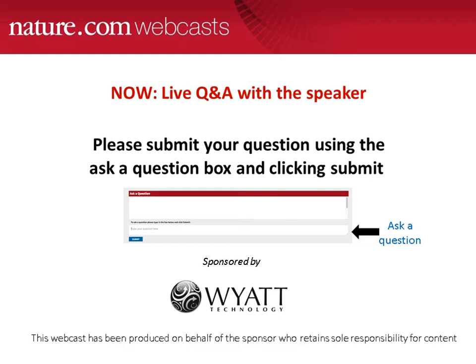Excellent, thanks, Eva. And our next question asks, what, in your opinion, is the primary benefit of SEC-MALS? My understanding is that you measure molecular weight independently of the elution position, and that it can analyze modified proteins with the ease of using the three-detector method. And the concentration range that you can access on a single system, ranging from 1 microgram to 10 milligrams per milliliter, is relatively remarkable. The dynamic range of the system is so big that you can characterize anything from a peptide to a particle that has a few hundred megadaltons in size. I hope the case is illustrated that we can really characterize almost anything on that system in terms of biological samples.